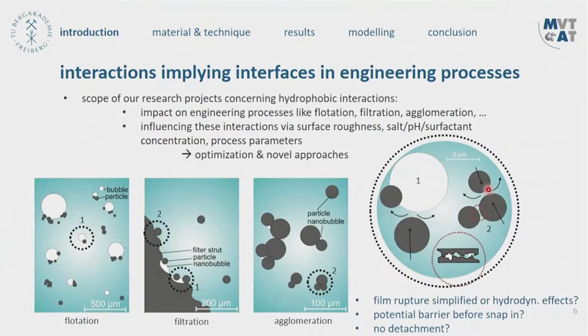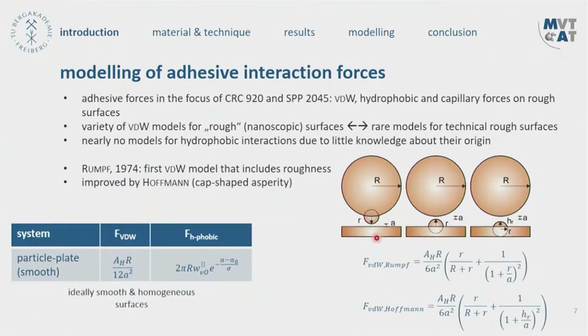Another thing we have to see, looking at capillary forces, is that the interaction between a surface and a gas-liquid interface is always connected to the rupture of this interface, because the solid wants to enter here. This may be with small parts, as we think of the interaction of nanobubbles affecting surface attraction, as well as on a large scale, if we put particles into a gas-liquid boundary. But now coming to the question: how do we describe the particle interaction, how do we bring roughness into the game? Are we able to do so?